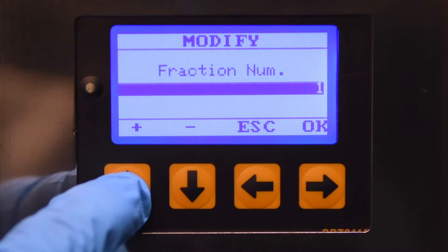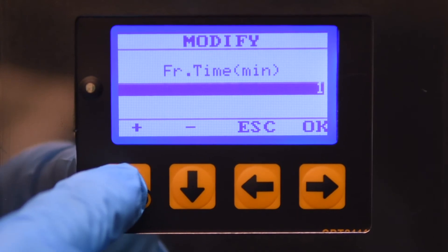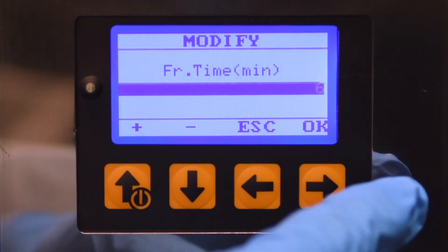Both instrument designs also permit sampling before an operation or at rest, during the operation, and at the end of each processing cycle.